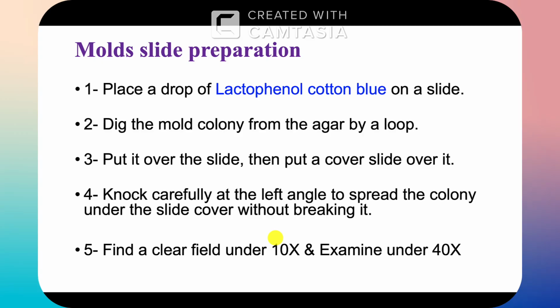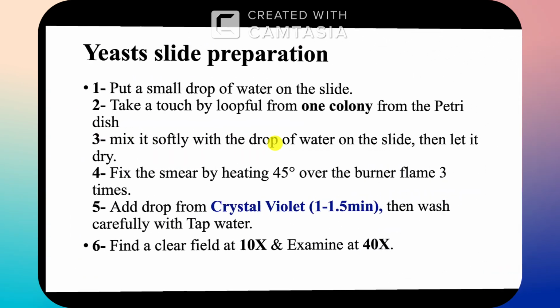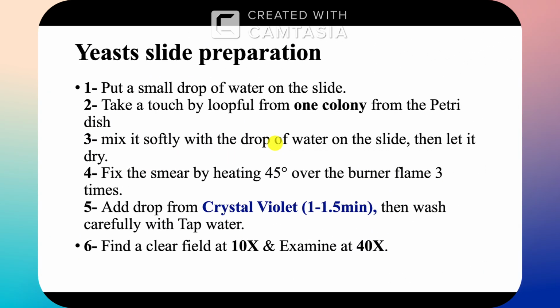After the incubation, you can take a small colony on a glass slide, in a drop of water and a drop of lactophenol cotton blue, and put a cover slide, and then immediately examine under the microscope at 10x and 40x, of course. You will find the colony I am going to show you now.